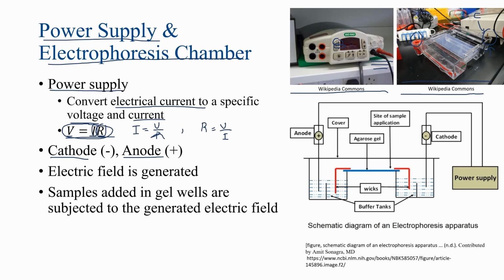It will be the location where the electrons will leave. So this insert where you add the black electrode, or the cathode, will have a wire that goes across the electrophoresis chamber, and it will result in the release of electrons out of the cathode. On the other hand, the anode is labeled in red, and the anode is the spot where electrons will enter.